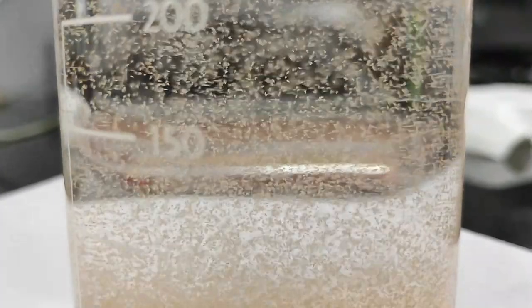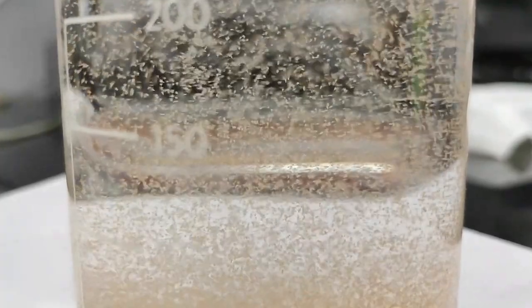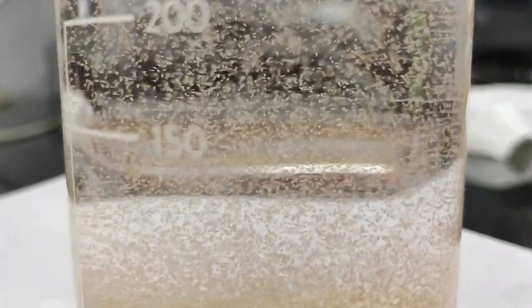Now we know how many nauplii we have in our tray, so it will be easy for our calculation and we can properly feed our post larvae in order to get high quality, high health post larvae.